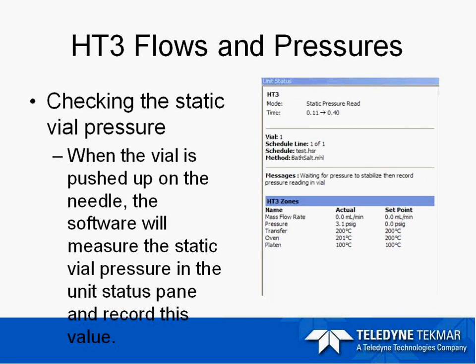Checking the static vial pressure on the HT3 is easy — it is checked automatically when the vial is run. Place your sample vial in the carousel and start your sample run. As soon as the vial is pushed up onto the needle, the software will measure the static vial pressure and display it in the unit status pane. It also records this value in the sample history. This makes it much easier to measure the static vial pressure if you have different matrices from sample to sample. A static vial pressure of zero during a run indicates that a vial was not crimped correctly, so the sample history log in HT3 software is very vital to help you monitor your samples.